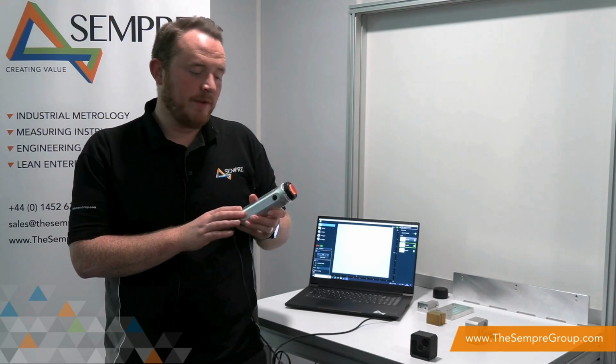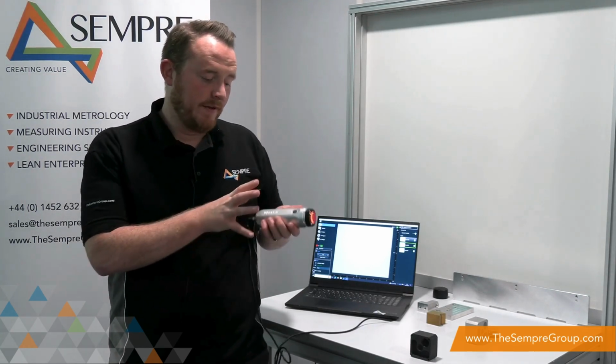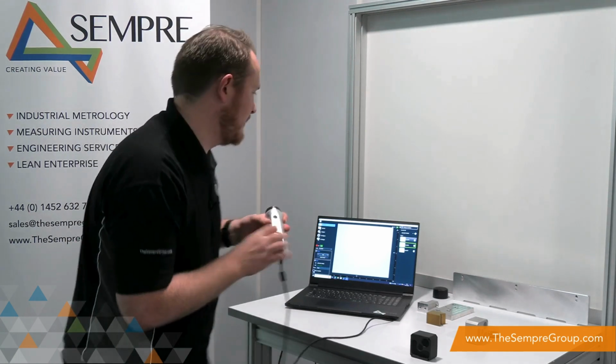Using the GelSight Mobile Series 2, we're able to capture profile roughness and surface roughness. So the capability of this equipment is to measure between 2 and 20 RA, but using the GelSight Max system, we can characterize between 0.2 and 20 RA. So it's just something to note.